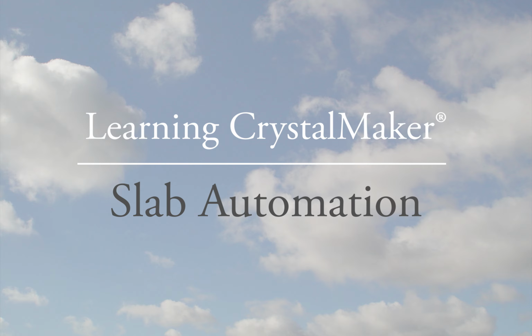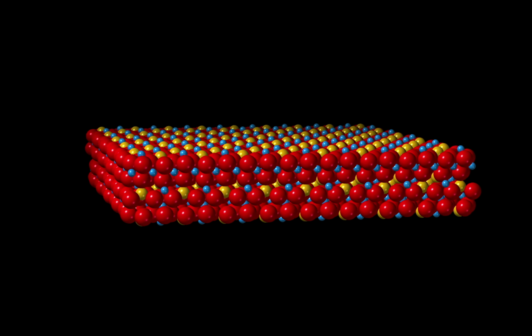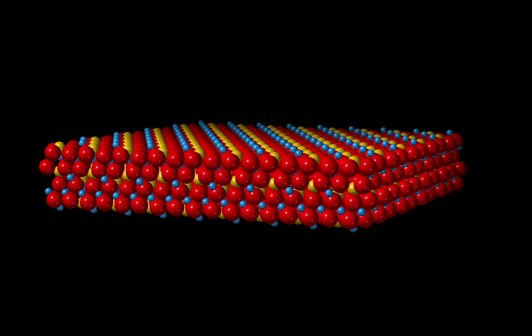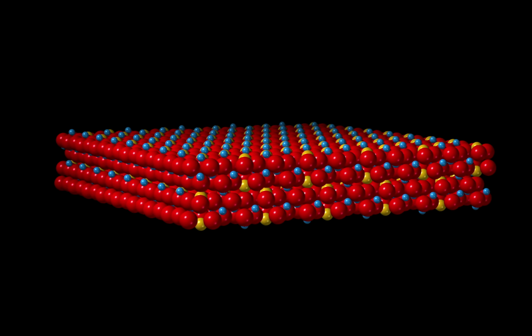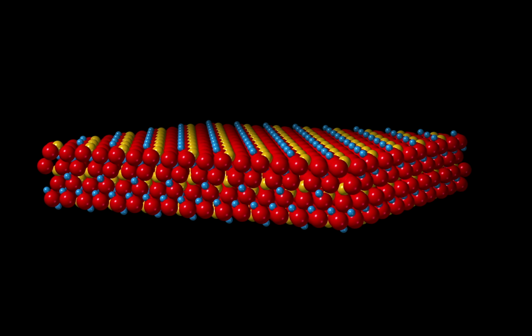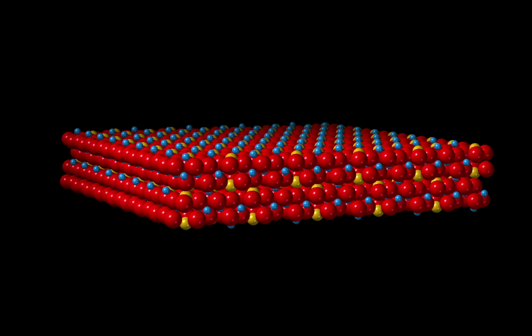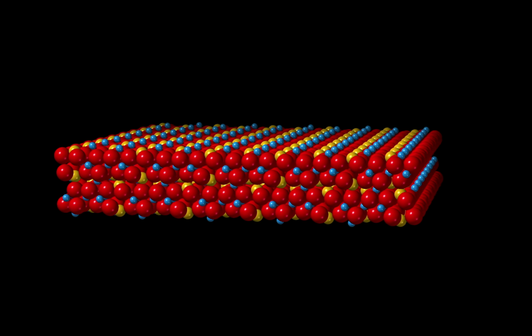Welcome to CrystalMaker 11. This tutorial introduces you to the slab automation feature, which we added in version 11.6. CrystalMaker has always allowed you to create surfaces and parallel-sided slabs, but this typically involved a series of steps with slicing of layers. Now the process has been automated, and it lets you specify both the slab diameter and its thickness, as well as its orientation.